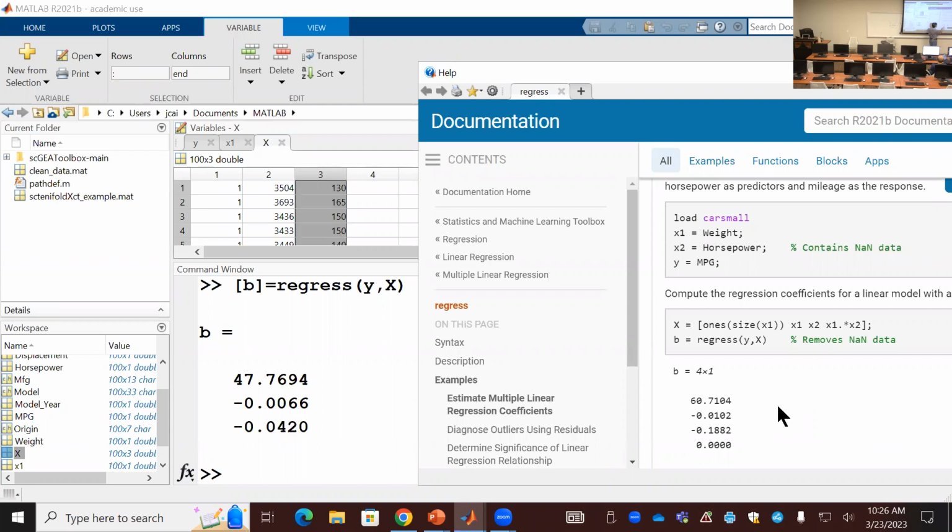And at the end, you see this interaction term has a beta of 0. So this one plays no role at all in adding any value to help explain the variable. So eventually you can get rid of this, because the beta value is too small. It contributes nothing to help you build a better model to explain Y.